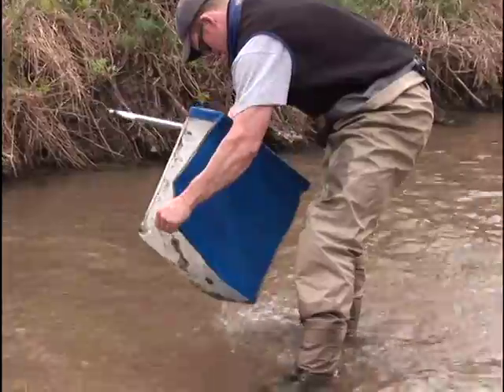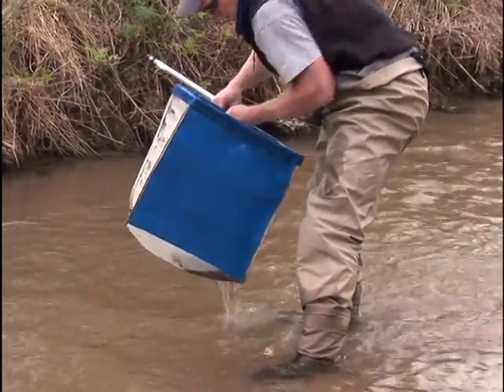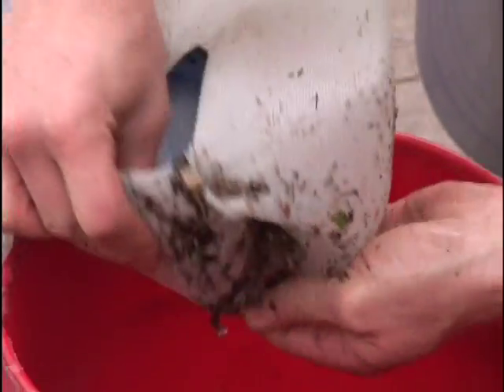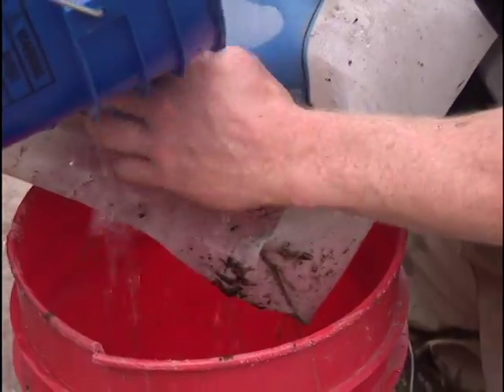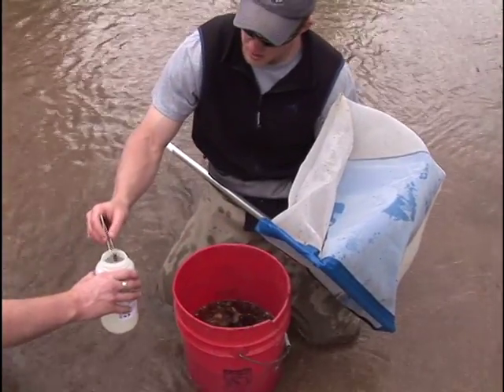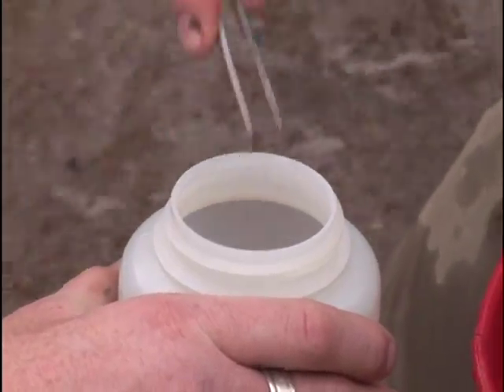Once the sample is collected and composited from all sample habitats and locations, gather the sample material into one corner of the net. Fill the bucket 1/2 to 2/3 full of stream water and turn the net inside out into the clean sample bucket. Knock or wash any obvious macroinvertebrates, debris, algae clumps, or masses into the bucket. Examine the net closely for organisms that may want to stay behind. Pluck these organisms off with forceps and place them directly into the sample jar.